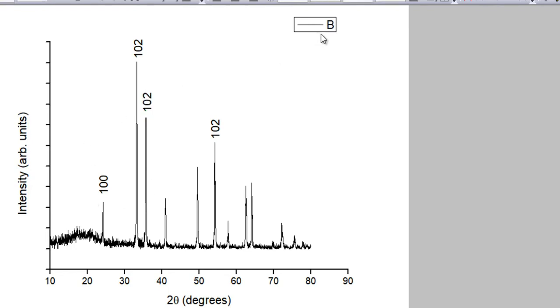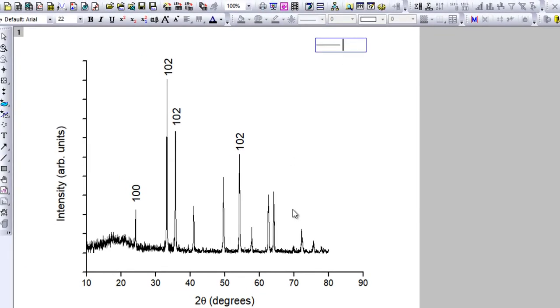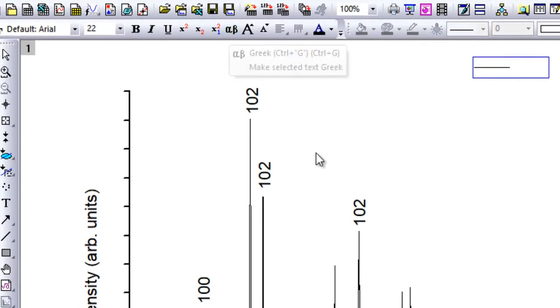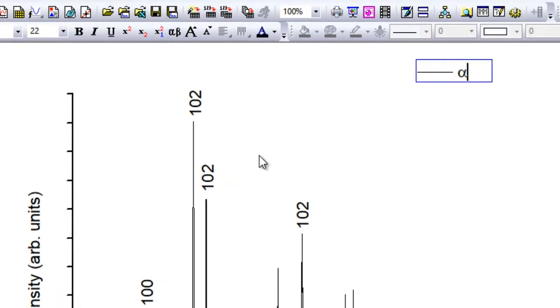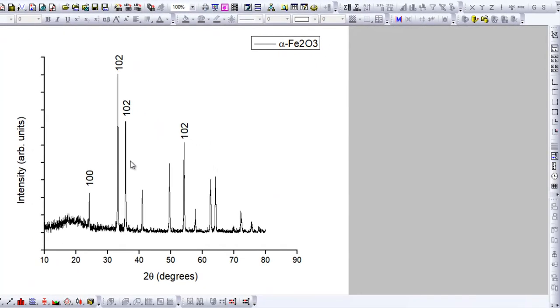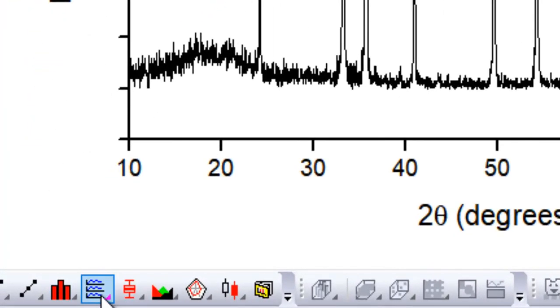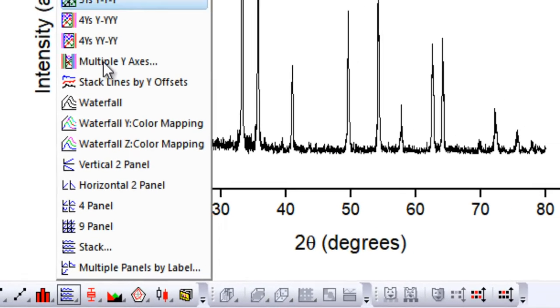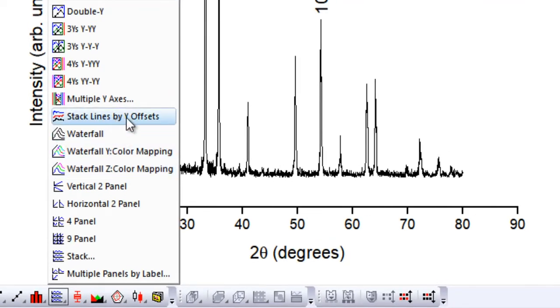In the legend, you can write what the line corresponds to — in my case it is alpha-Fe2O3. Alpha can be written using Greek notation by pressing Ctrl+G, typing A, then Ctrl+G again to exit, followed by 'Fe2O3.' This is especially handy when plotting multiple XRD patterns in a single window. I'll make another tutorial showing how to plot multiple XRD patterns using the stack plot — specifically 'Stack Lines by Y Offset.'